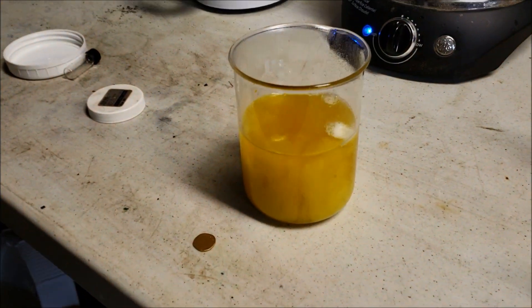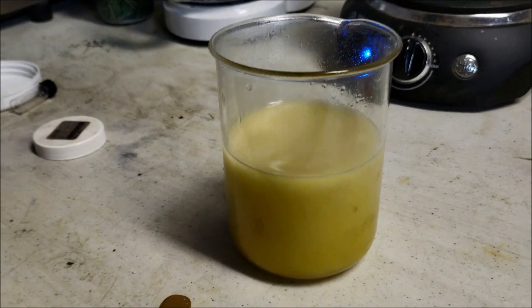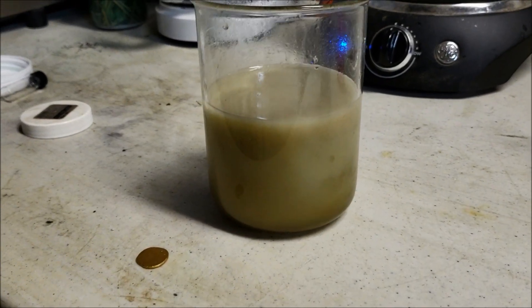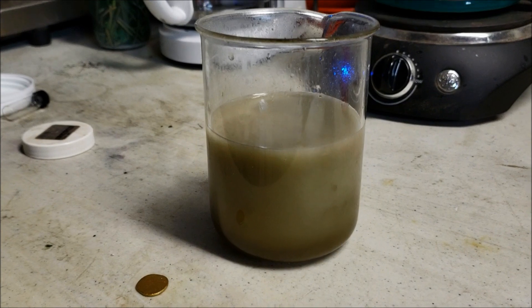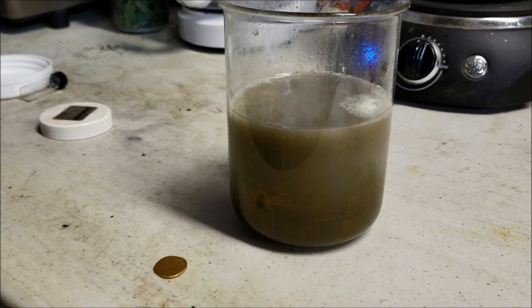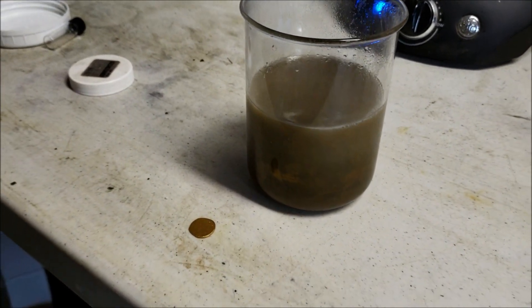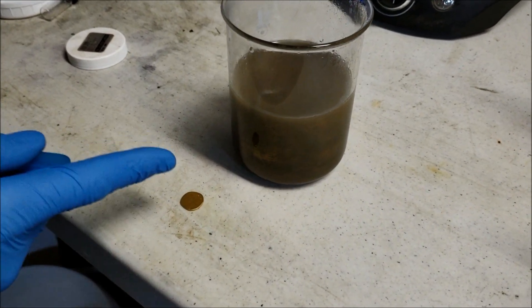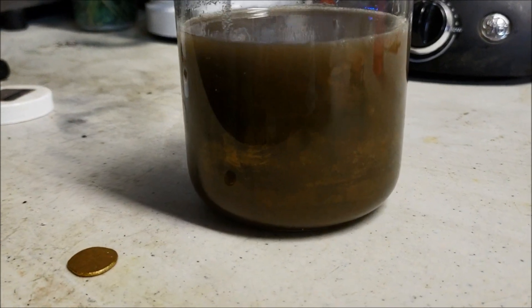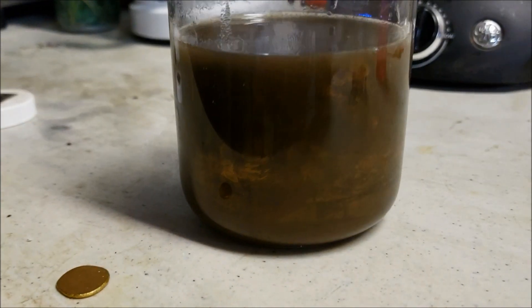Ooh, look at that, watch it! Oh wicked - oh my gosh, it's like the whole color wheel! Now we're gonna let it do that and it's gonna settle. You can already kind of see it falling down. That'll all settle to the bottom, all the clear liquid will be at the top, and then we will filter it again and then we'll burn it.